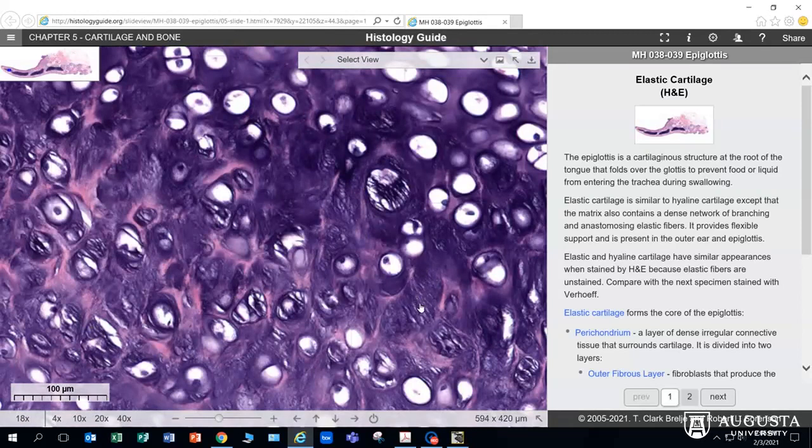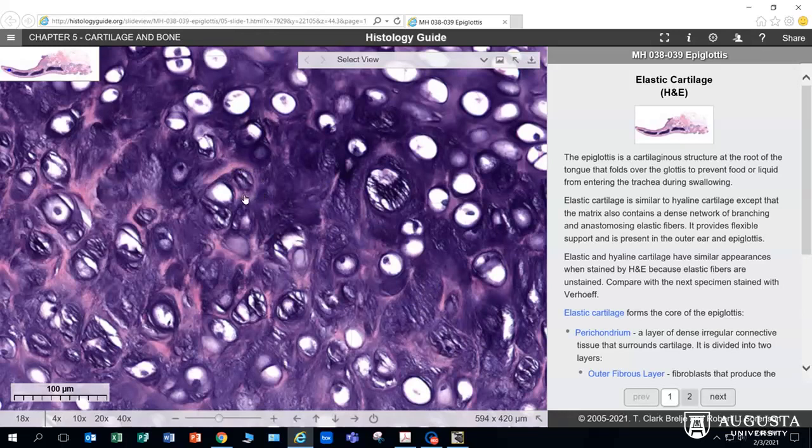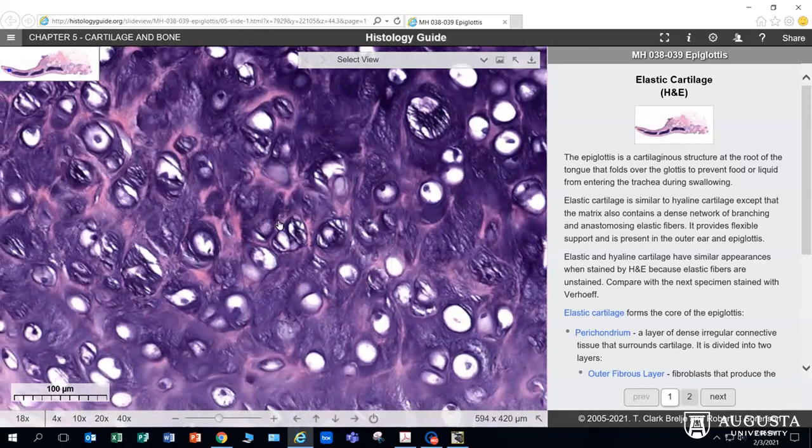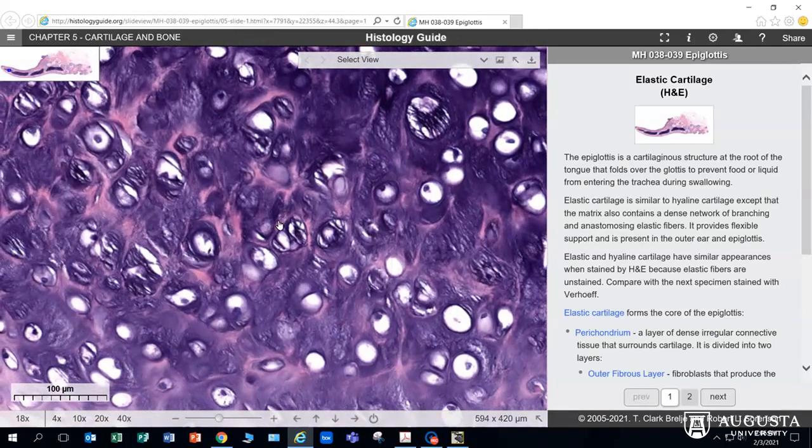Elastic fibers all through here. The pale pink here would be collagen in between those elastic fibers. So again, this is elastic cartilage.